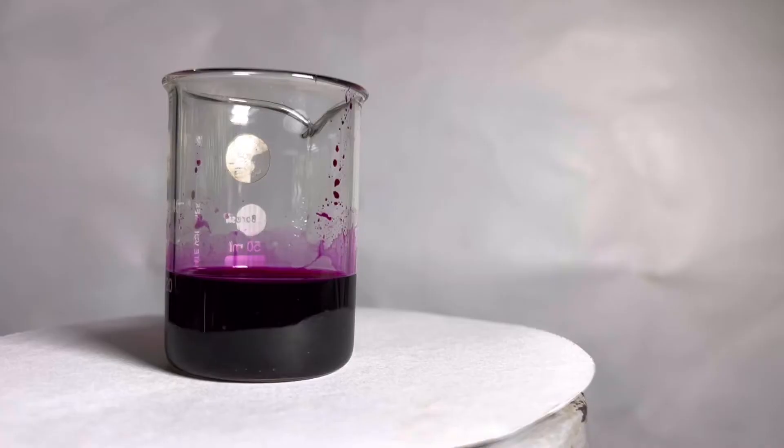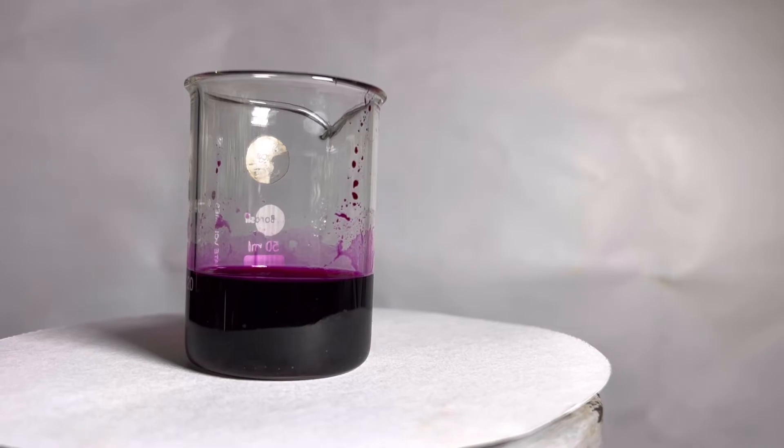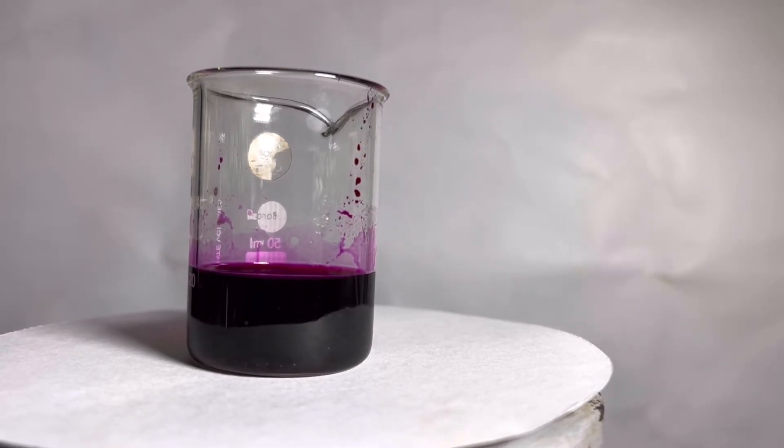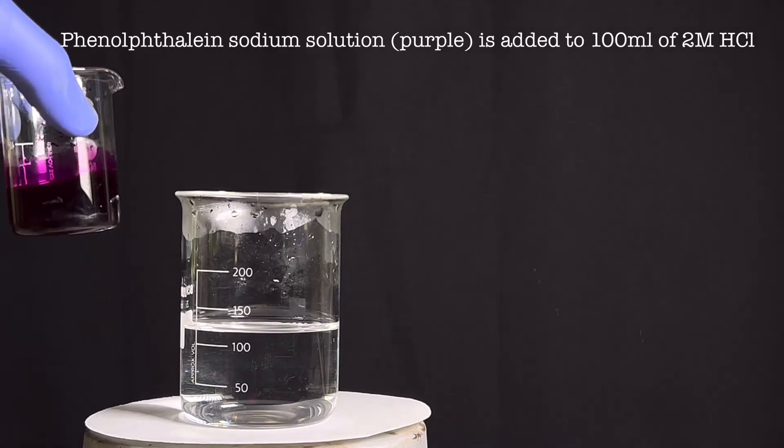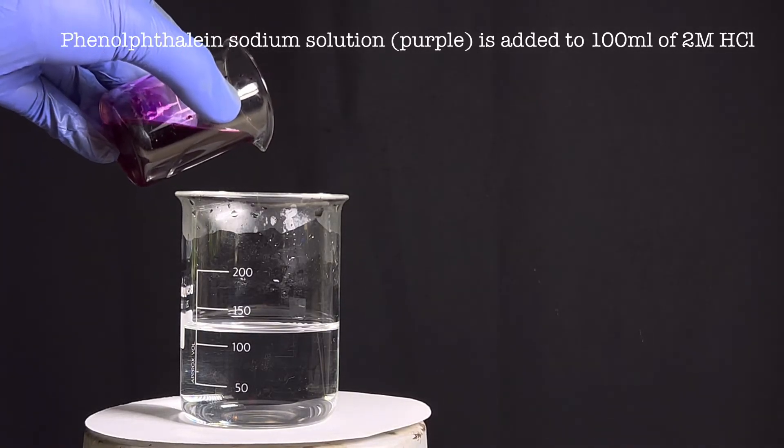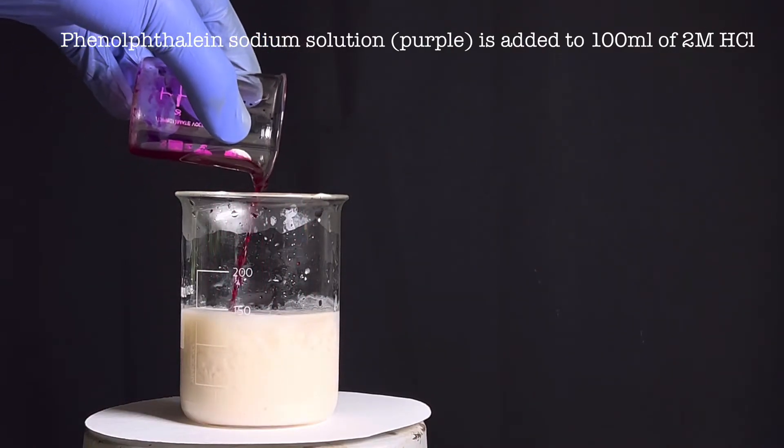Finally we take the aqueous phenolphthalein layer. It has a high concentration of phenolphthalein. The phenolphthalein solution was poured into 100 ml of 2 molar hydrochloric acid. Immediately the salt form is converted back into its original form and it crashes out as a white precipitate.